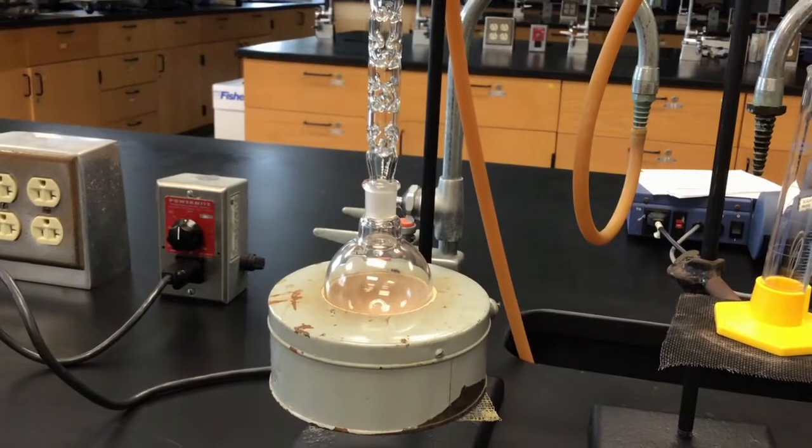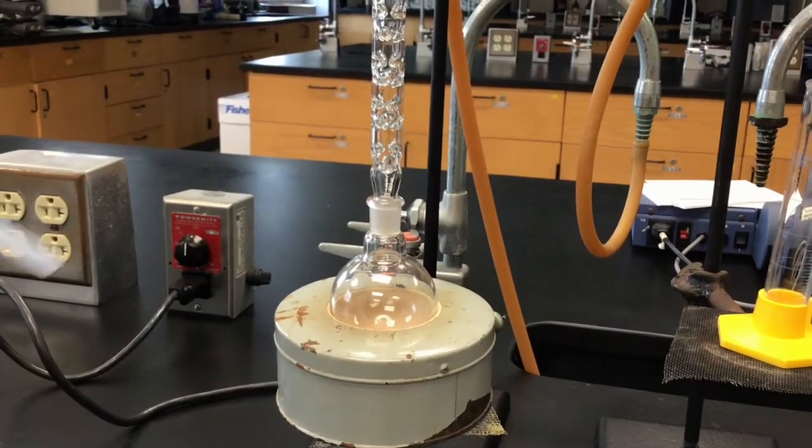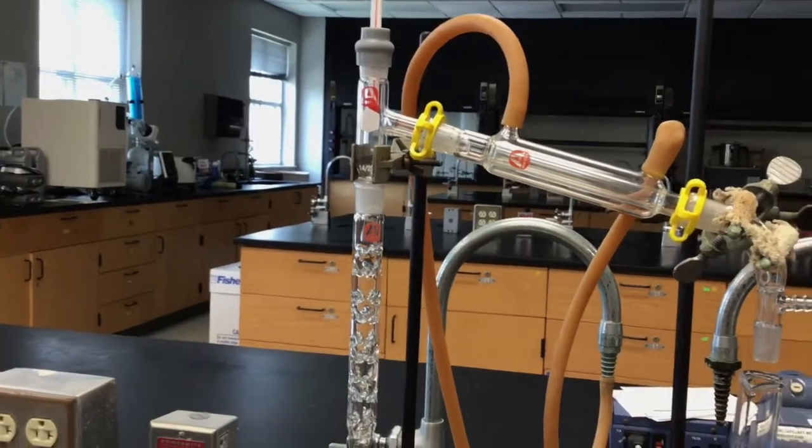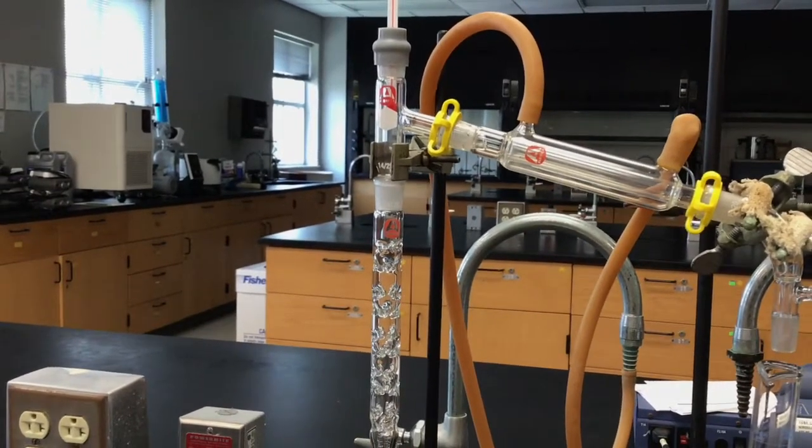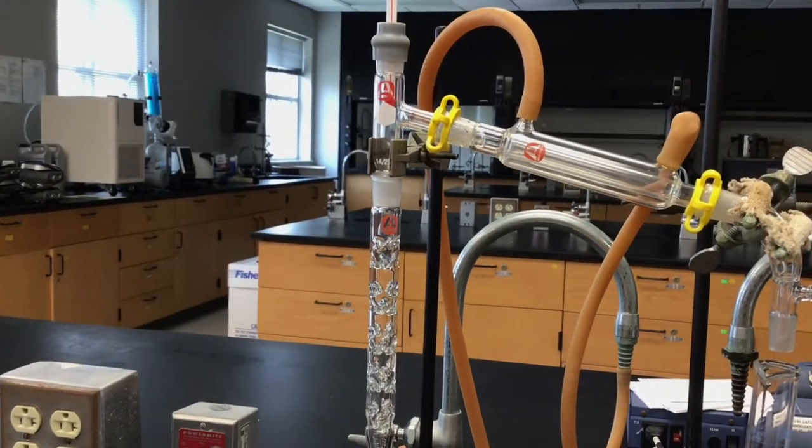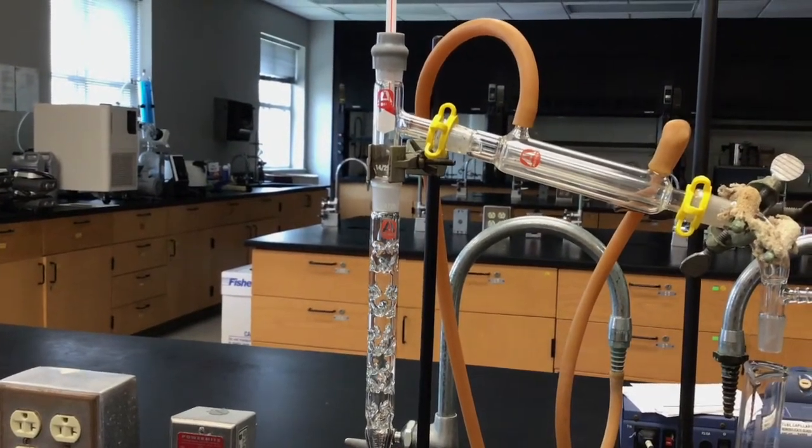When you're actually performing your distillation, you need to adjust the amount of heat that's going to it so that your distillate produced on the side is about one drop per second. If you do it too fast, you're adding too much heat and you're not going to generate a clean separation between the two and if you're doing it too slow, well, you're going to be here forever and that's not good for now.